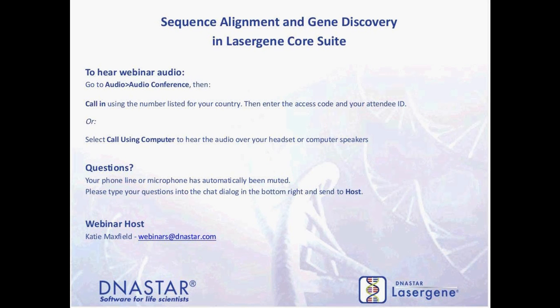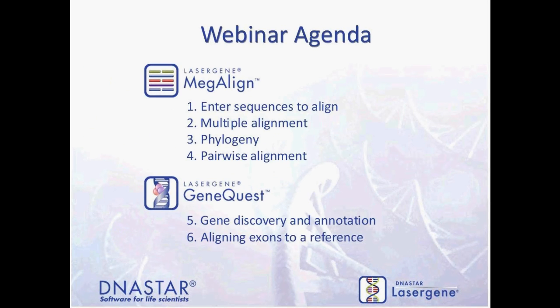As Katie said, my name is Reynolds, and I am a technical sales specialist with DNASTAR. And today I'm going to be going over the MegAlign application as well as the GeneQuest application of the Lasergene Core Suite. And I'll be focusing in the MegAlign module on how to enter sequences in for alignment, doing a multiple alignment, looking at some phylogeny information, and then performing a pairwise alignment.